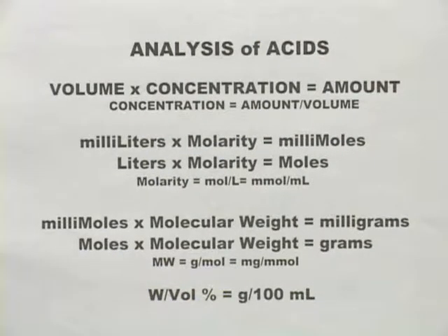Now we're pretty well finished as far as experimental techniques are concerned, but before calling it quits, just a reminder, here are the calculations that you should really understand. If you understand the experiment and these calculations, you should have no trouble. There's a few definitions here, molarity and molecular weight, and then the concept that if you have a volume and you know its concentration, you know the total amount. So this relationship is also important.